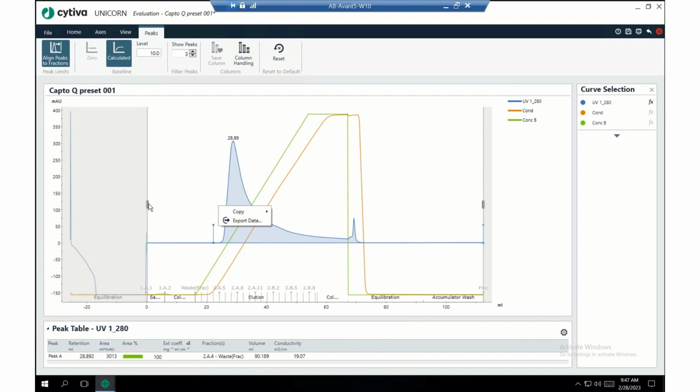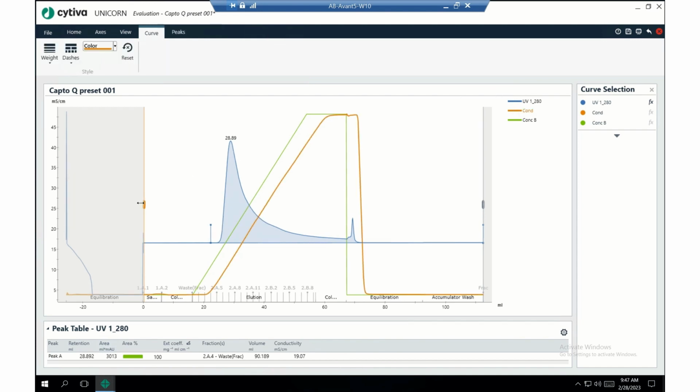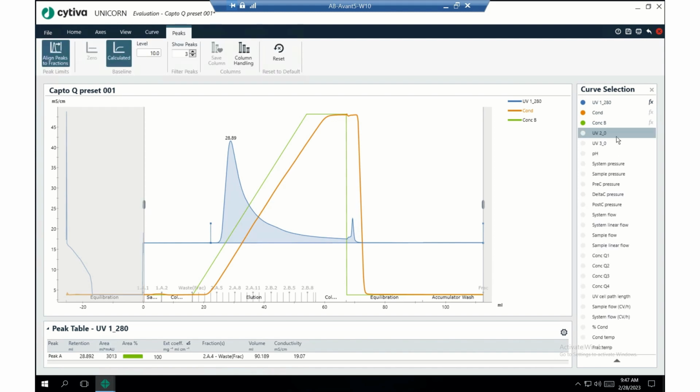Let's see here. So we'll use this marker. I'm going to set it to conductivity. Okay, and then isn't there a percent? So the funny thing is, because of the column, the actual concentration is offset by 5 mils or 1 CV from the conductivity. So you kind of have to imagine it. You can also do, I think there's a percent conductivity right here.